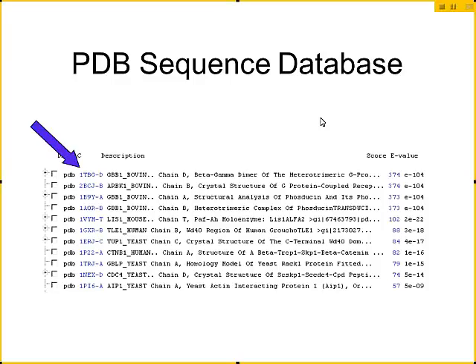You can see your e-values here. The e-value is giving you the expectation that you will get a bit score that high for random reasons, so you actually want your e-value to be as small as possible. If you have an e-value less than 10 to the minus 3 or 10 to the minus 4, that's a rough rule of thumb that says that's a significant match — my sequence and this sequence in the database share more sequence similarity than we would expect for random reasons. You can see that the sequence submitted here is similar to the sequence of the protein in 1TBG-D; the e-value is e to the minus 104, so it's very significant.